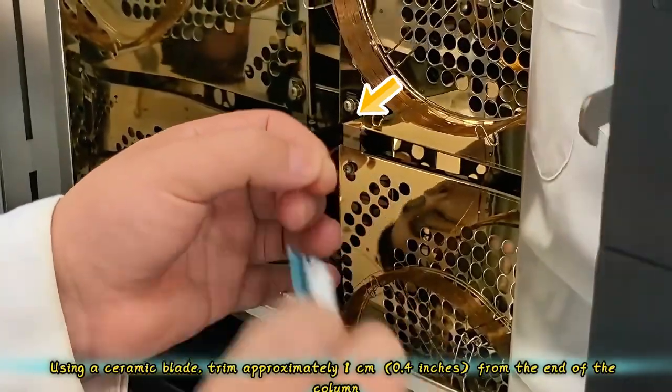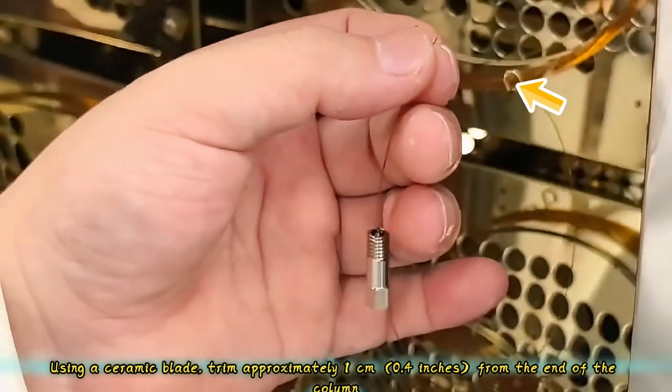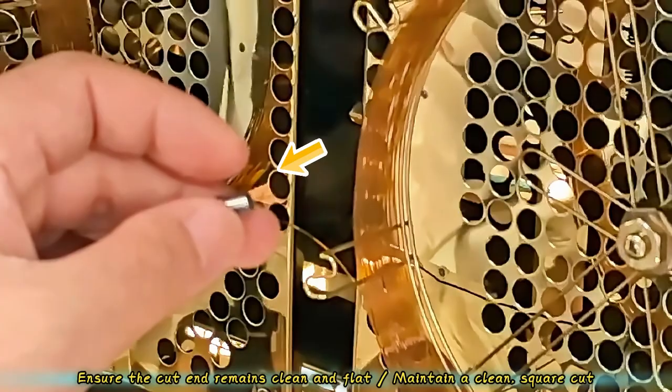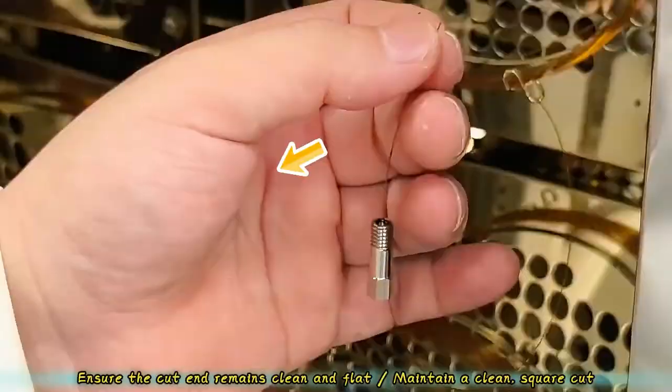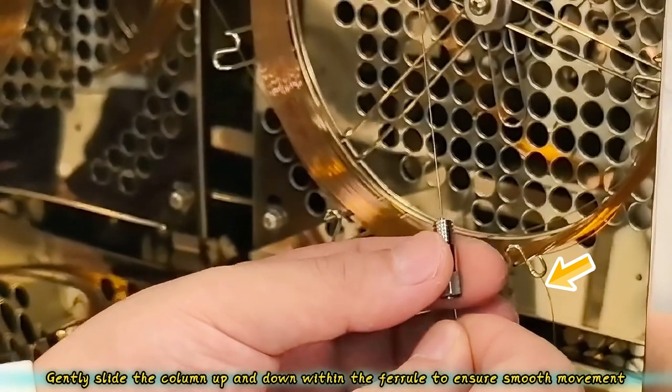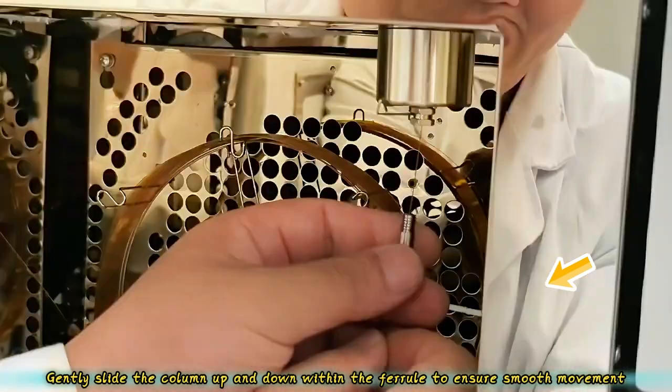Using a ceramic blade, trim approximately 1 cm (0.4 inches) from the end of the column. Ensure the cut end remains clean and flat. Maintain a clean, square cut. Gently slide the column up and down within the ferrule to ensure smooth movement.